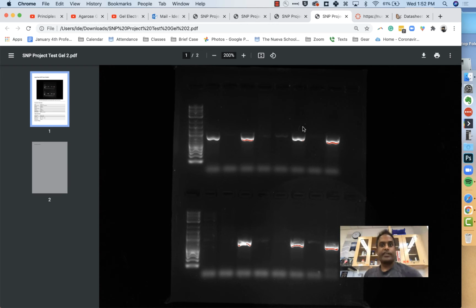What up, everybody? We just finished lab, and now I'm going to teach you how to analyze gels. Okay, so in class we went over what a gel is, what it looks like. You probably practiced a little bit, so I'm going to do that part quickly.